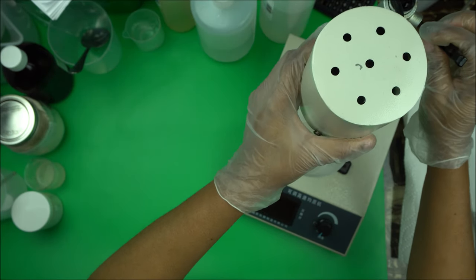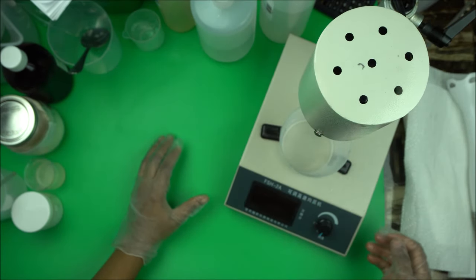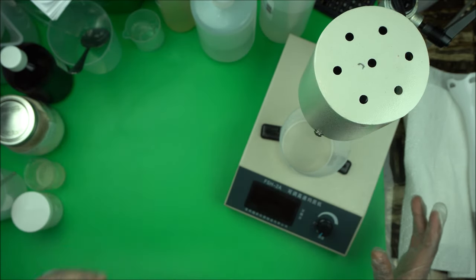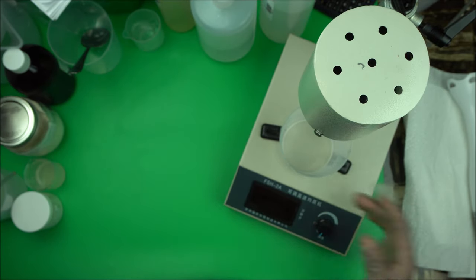It can go as far as here. That's where it can go, and you will be able to put in a bigger beaker. The maximum, like I say, is 1,000 ml.